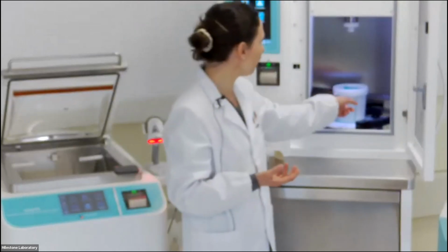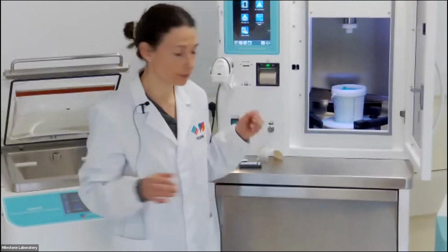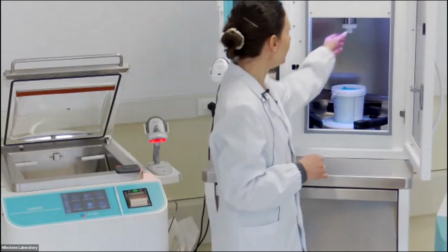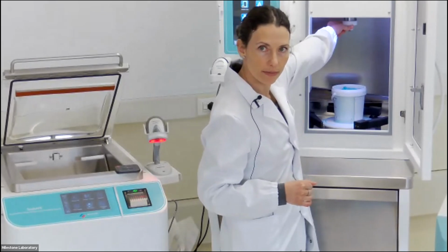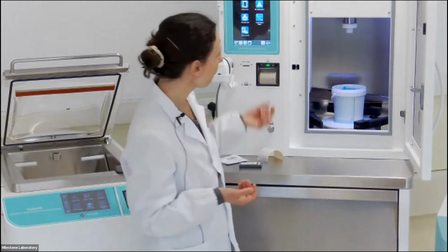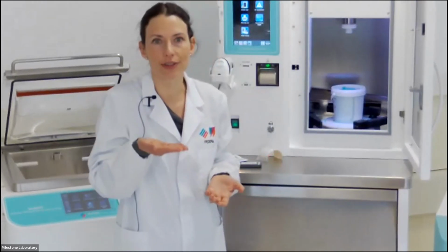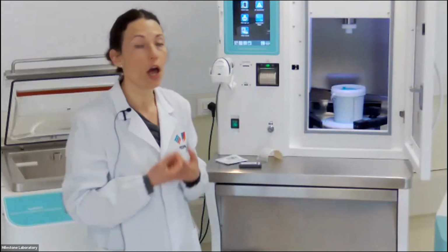Moreover, here we have a scale that measures the weight of the specimen. The scale will detect if the bucket is not present. Again, the formalin will not be released. Very important for the safety is this. This is the formalin injection. As you can see from this movement, we can understand from this sensor if the bucket is present or not. Moreover, we have here also an overflow sensor. So if the sensor detects formalin present, absolutely the formalin loading will be stopped.